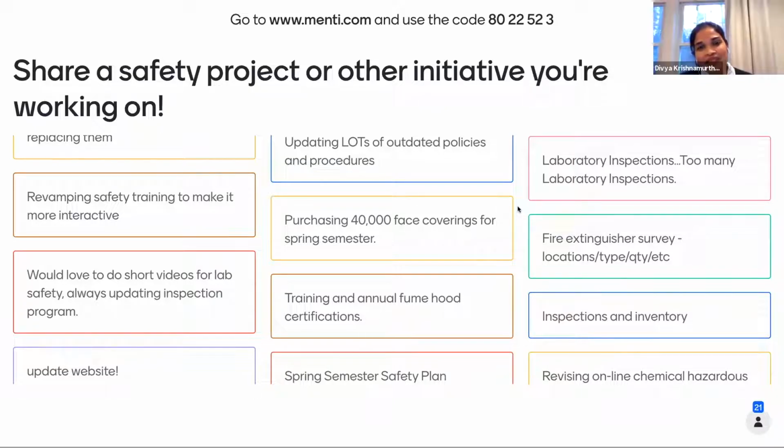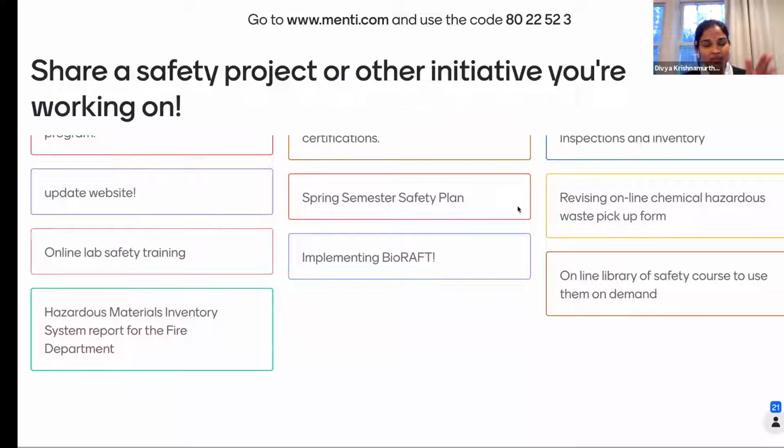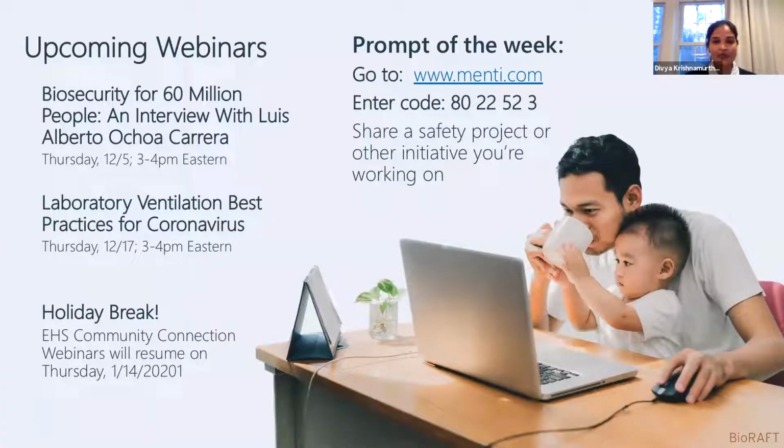Yeah, we have something similar to what Anne mentioned. So we have the chemical inventory system that is only used to track chemicals. And when the system was put in place, we had discussions on what is considered a chemical versus what is considered a consumable. For example, we have some things that are tracked as consumables separately, not through our chemical inventory, but it's essentially the same system. The difference is that they're just stocked differently, if that makes sense.